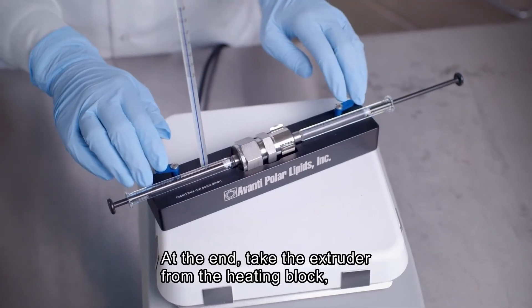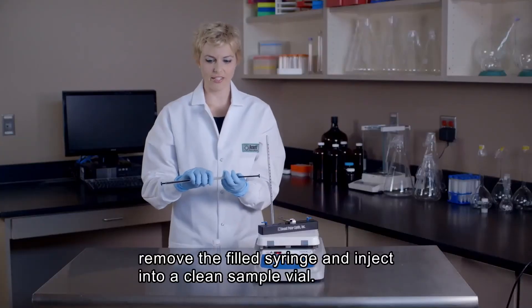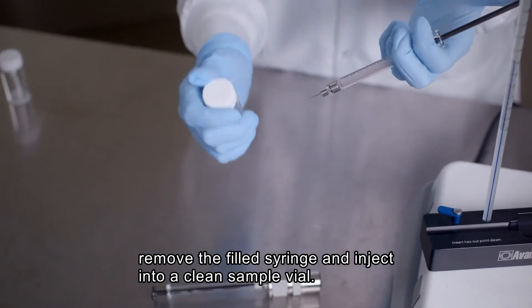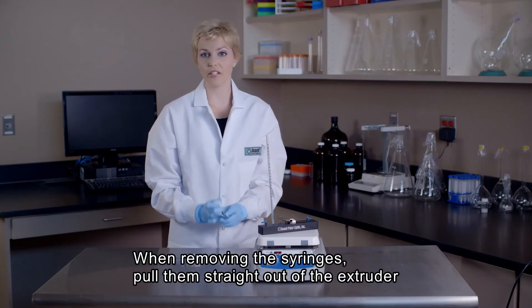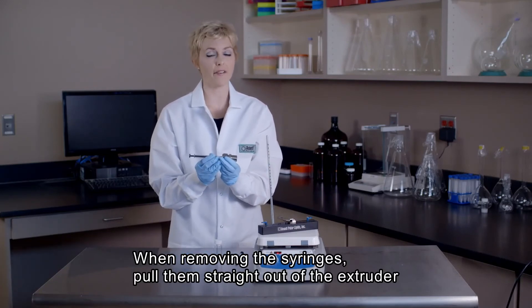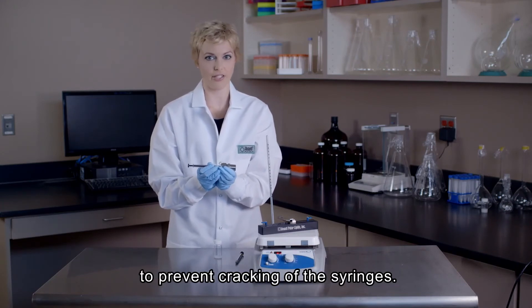After the final extrusion, remove the extruder from the heating block. Remove the filled syringe and inject the lipid solution into a clean sample vial. As a very important note, when removing the syringes, be sure to pull them straight out of the mini extruder. Removing them at an angle could induce cracking of the syringes.